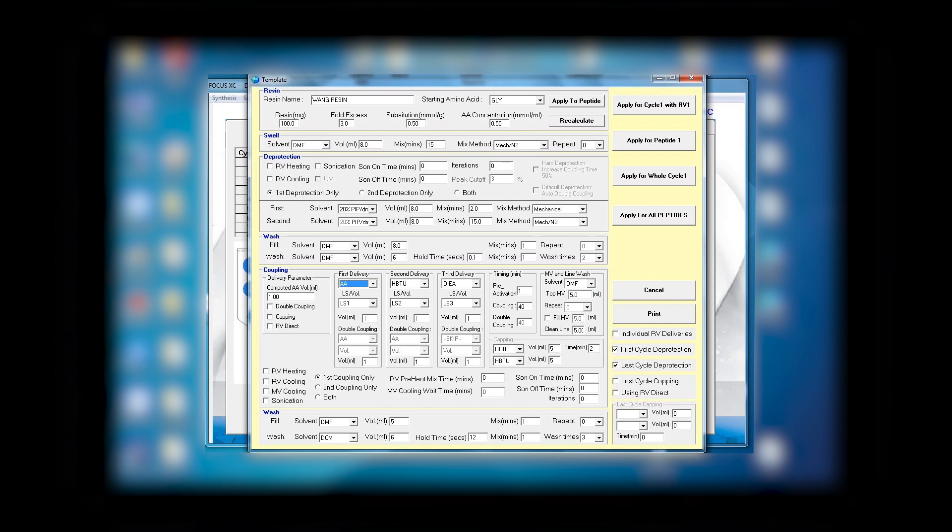Because you want to use one equivalent of amino acid, one equivalent HBTU, and two equivalent of the base. Next you see you can have more than one time of coupling. You can have automatic double coupling by selecting it. If you want capping, you select capping for each time. You can have different options at the same time.